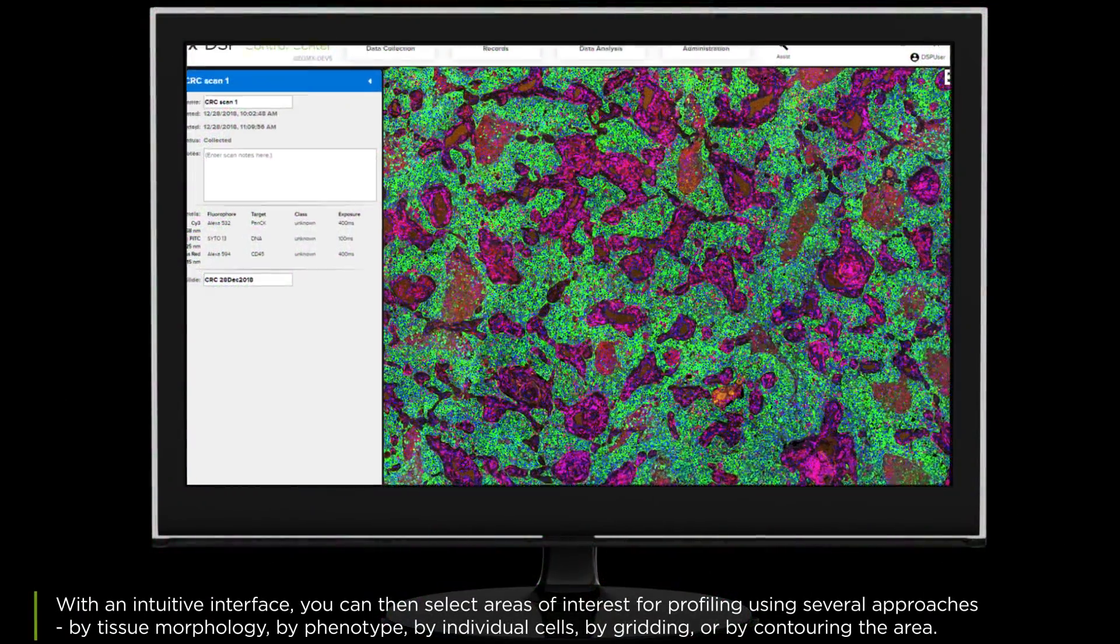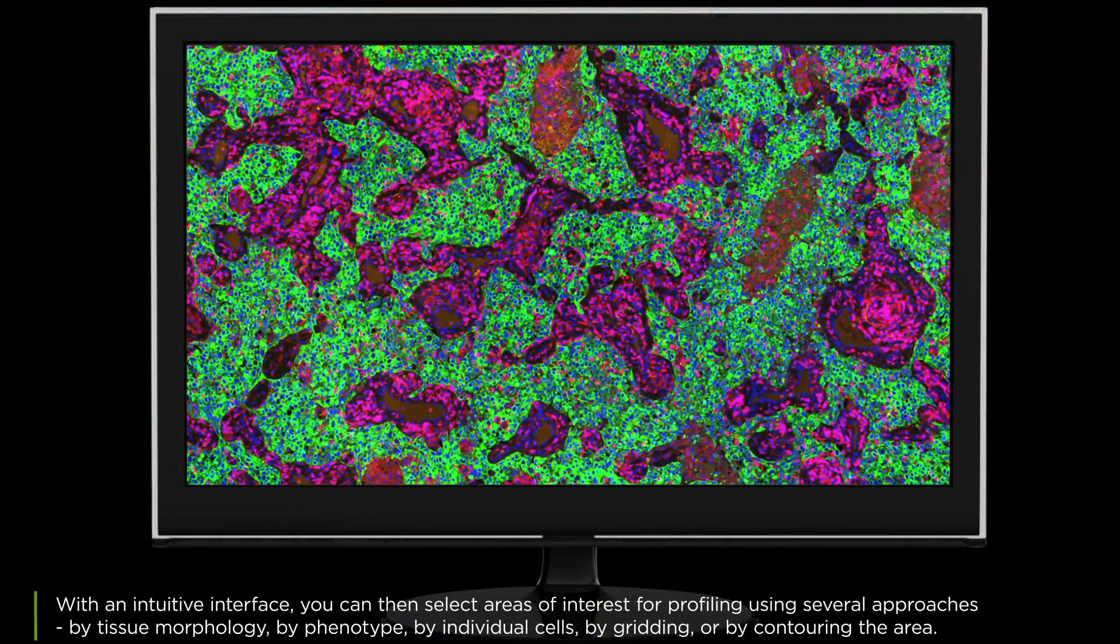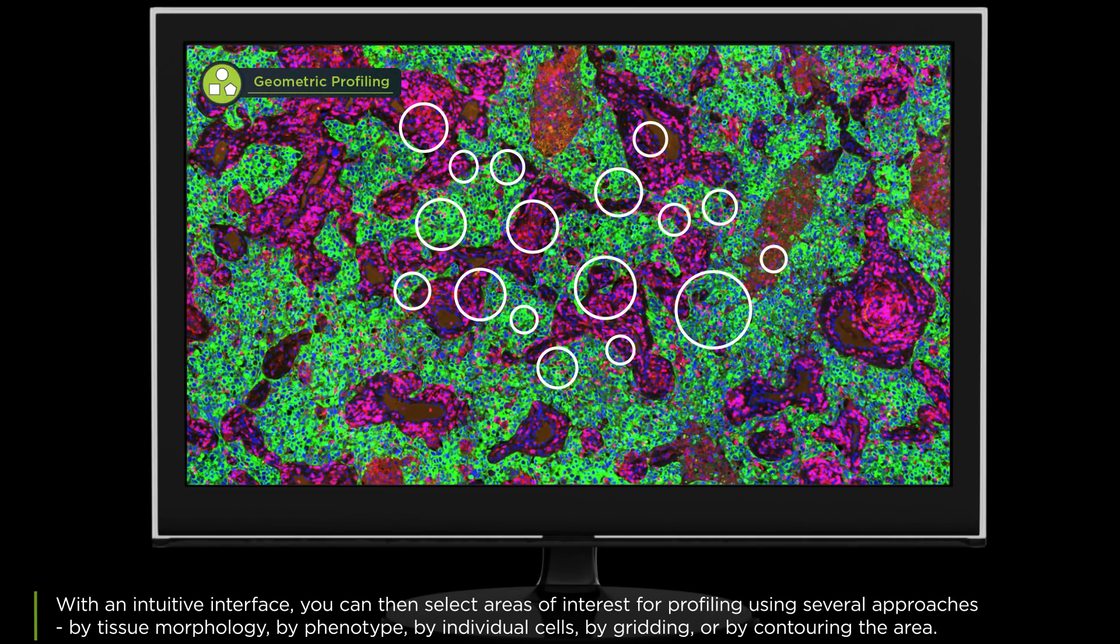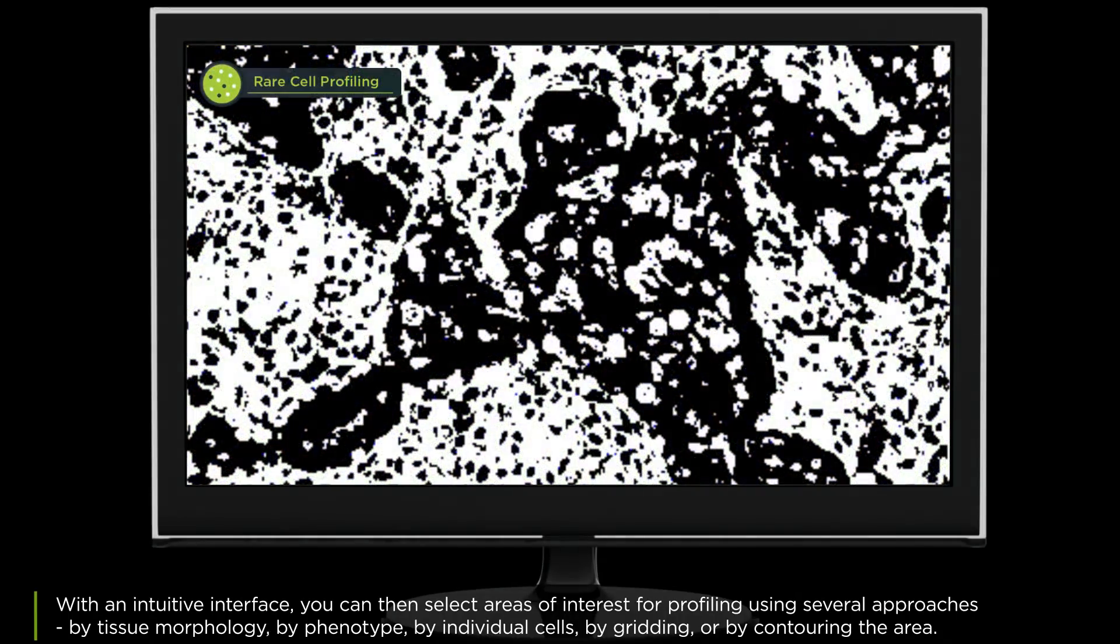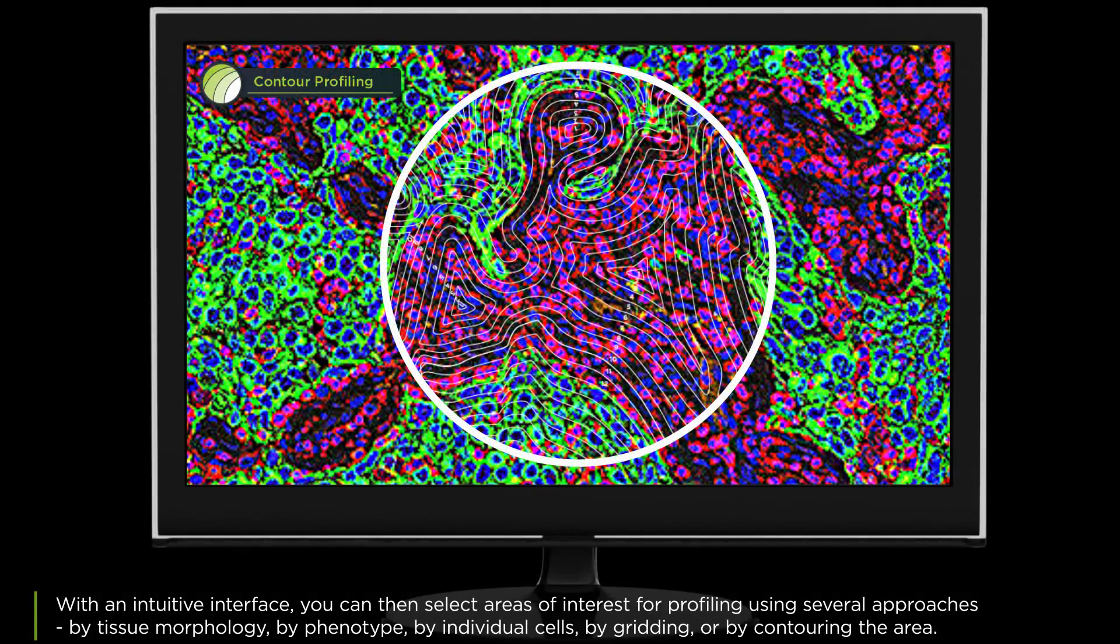With an intuitive interface, you can then select areas of interest for profiling using several approaches: by tissue morphology, by phenotype, by individual cells, by gridding, or by contouring the area.